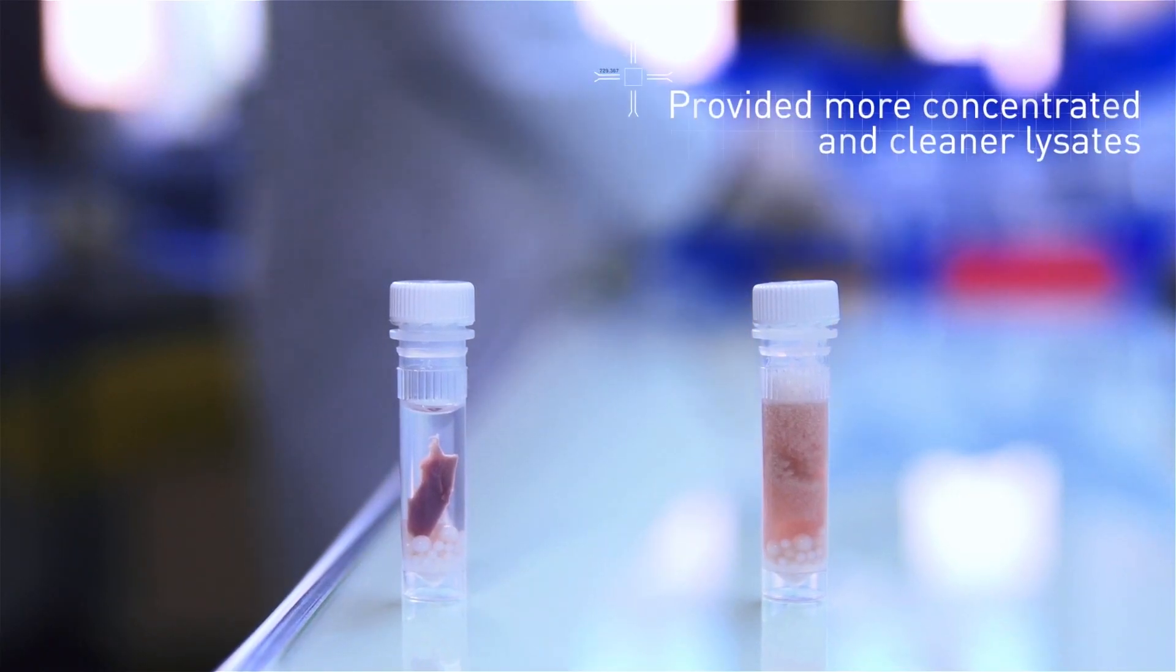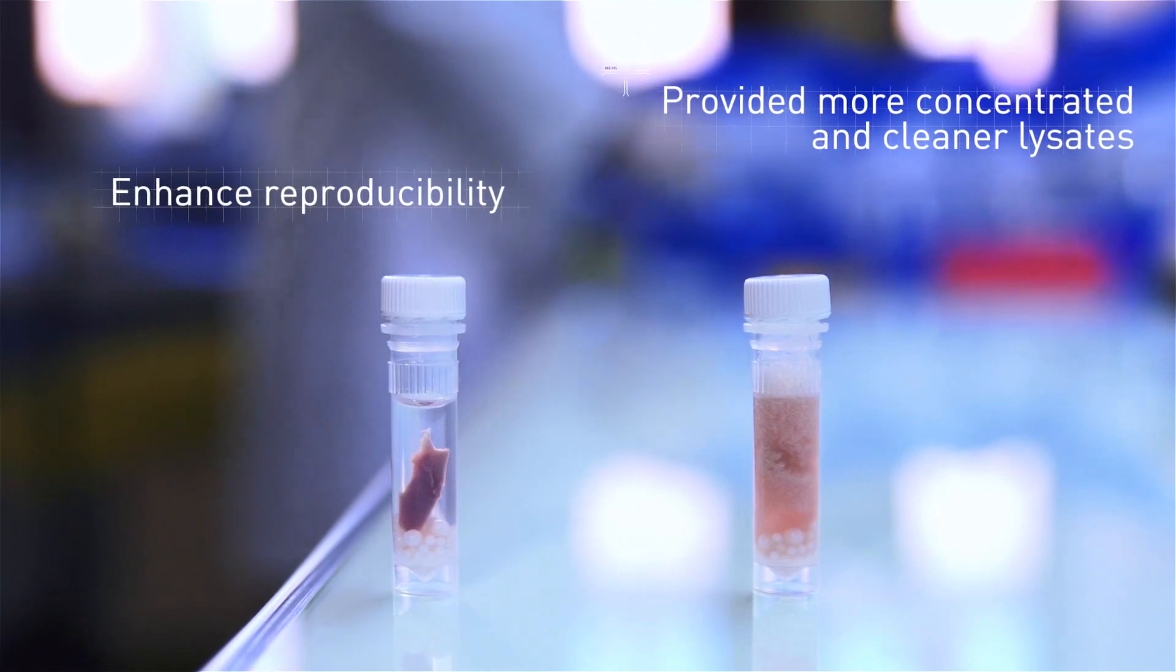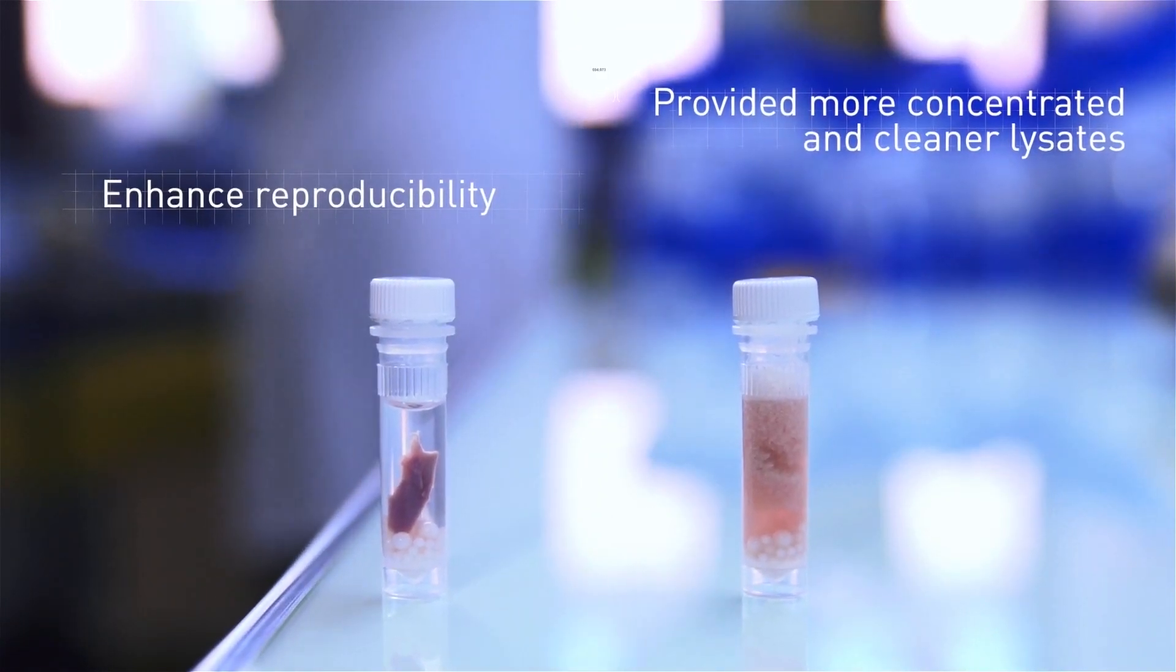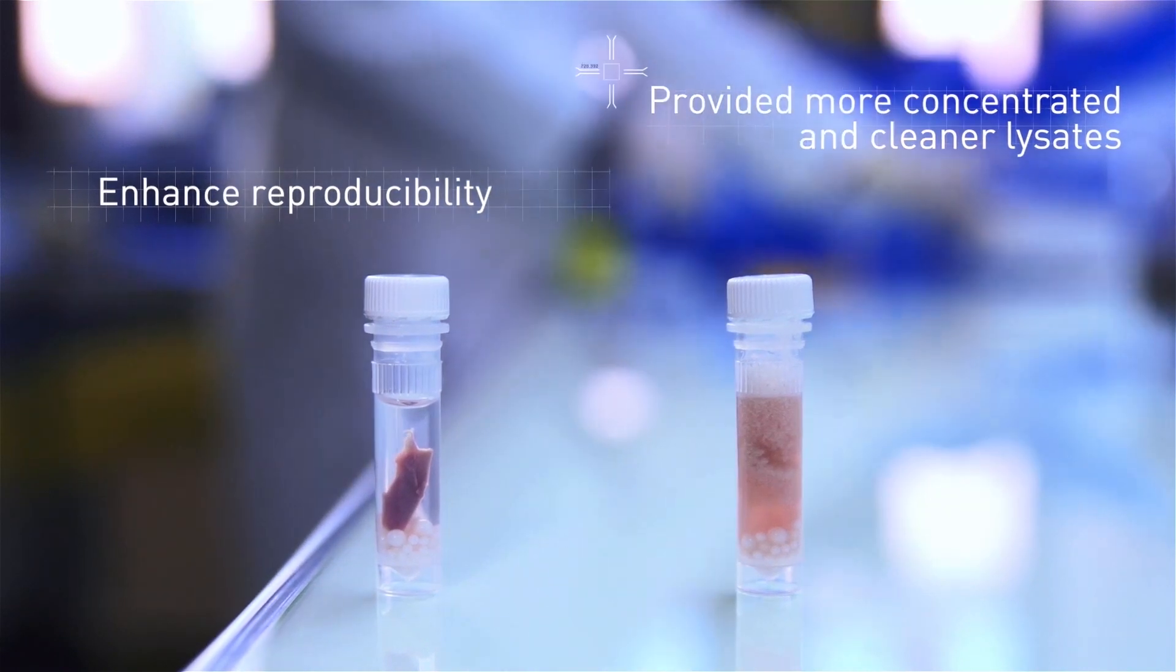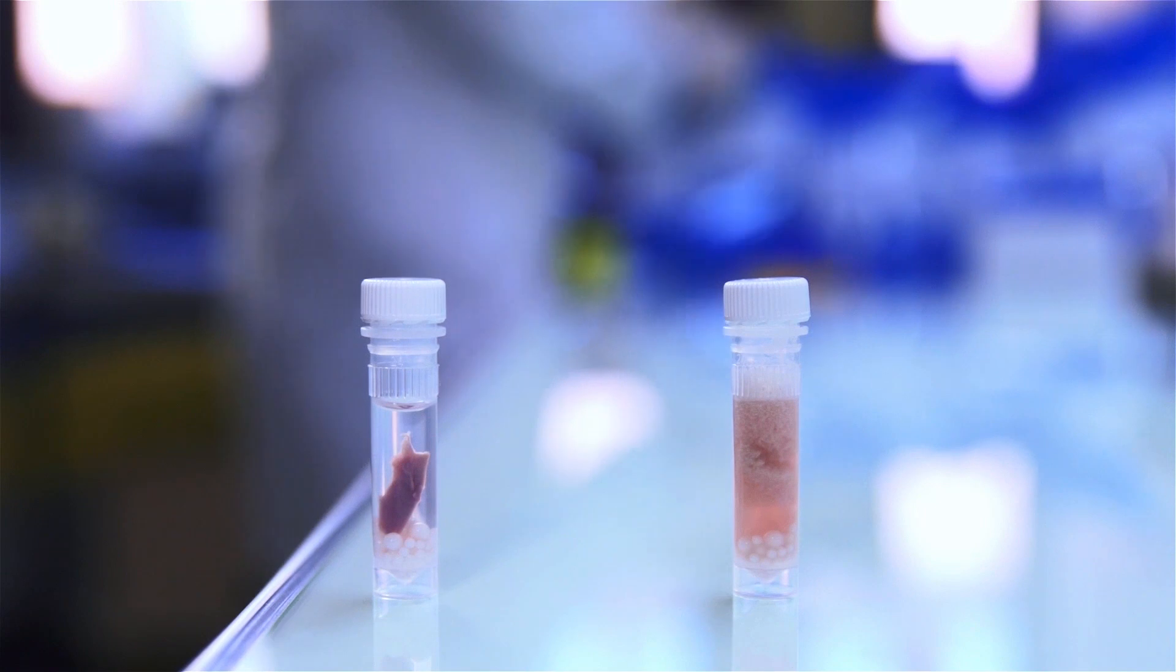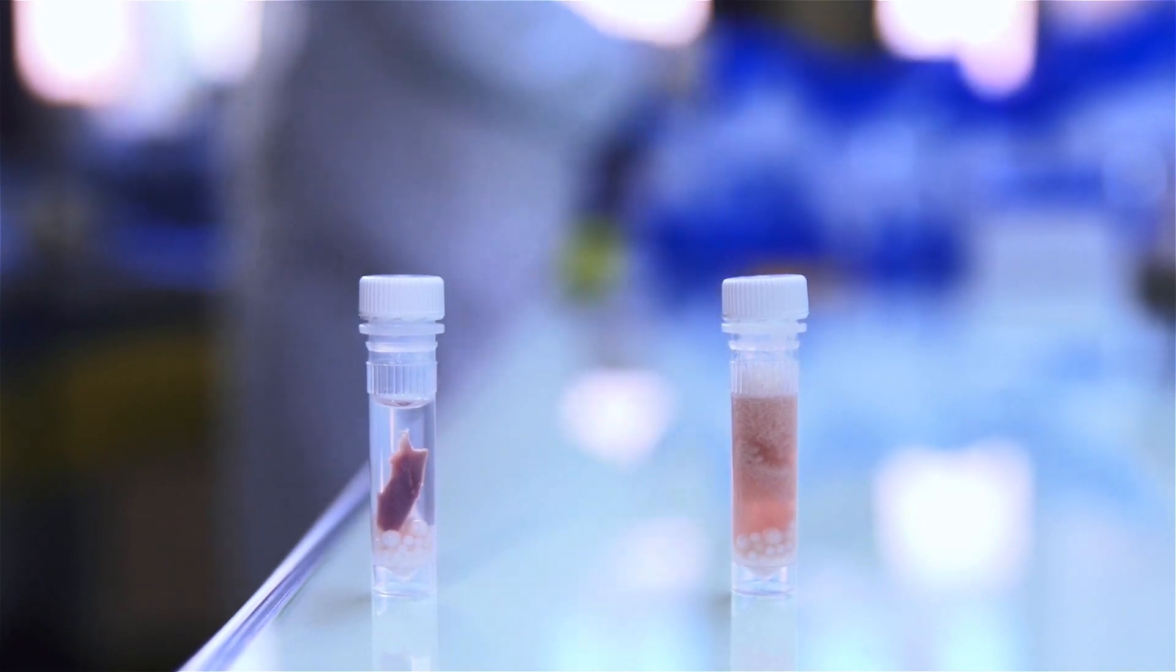The Kamin team found that the mini list homogenizer enhanced protein extraction results and provided more concentrated and cleaner lysates. This provides better experimental reproducibility, which is important in the quality control process.